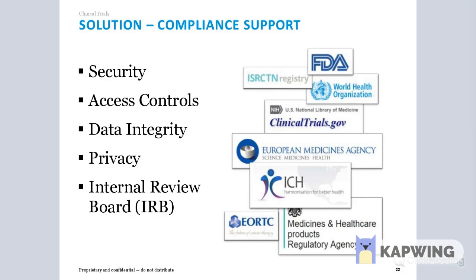Now let's talk about how a LIMS can help you tackle the compliance needs of your organization. Obviously, patient information security is a very high priority. Security: LIMS needs to be able to support all cybersecurity and patient confidentiality regulations for both on-premise instances as well as cloud-based offerings.